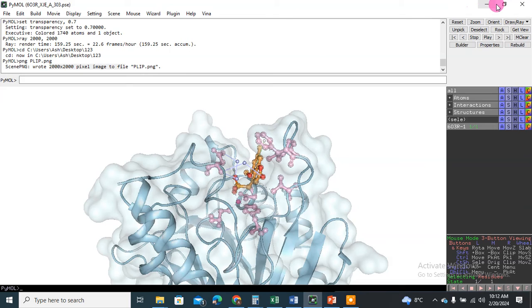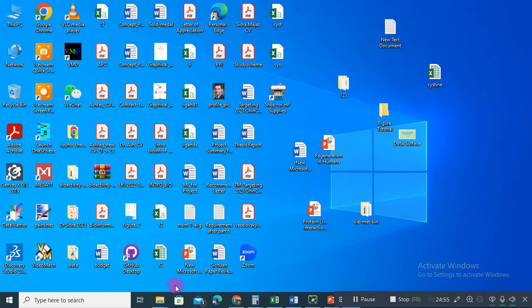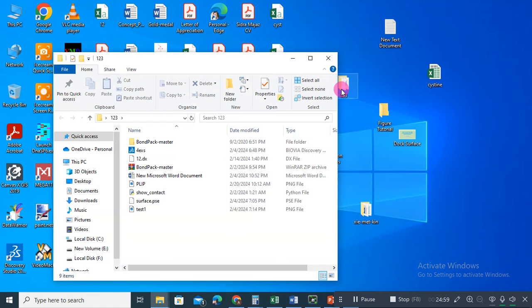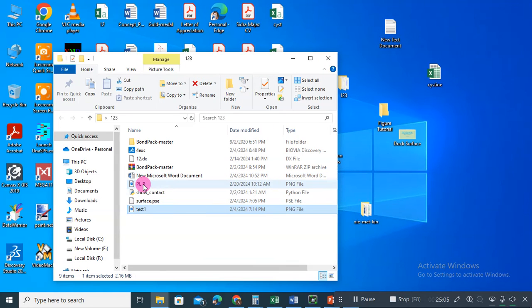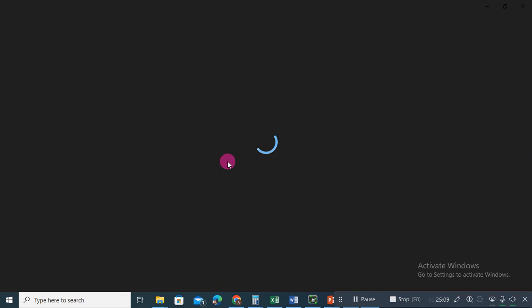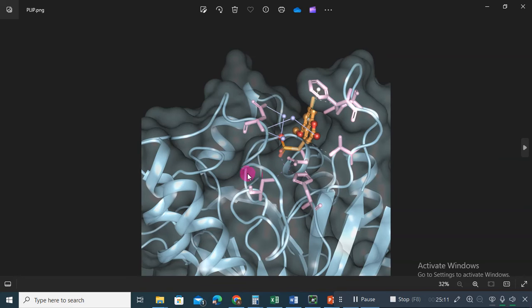Okay, I'm going to close it. Now let's see what kind of figure we have generated. Oh, it should be this one. Wait, PLIP. Okay, this is our figure, and I will also use it for the thumbnail.